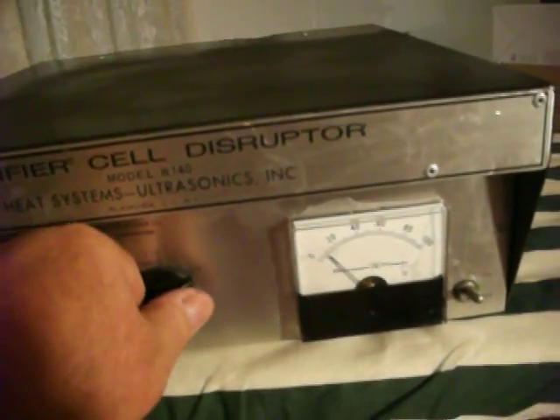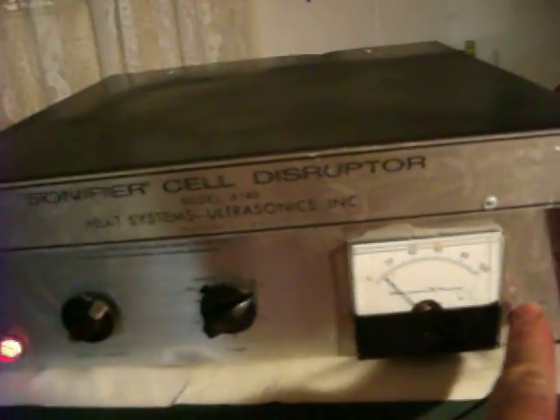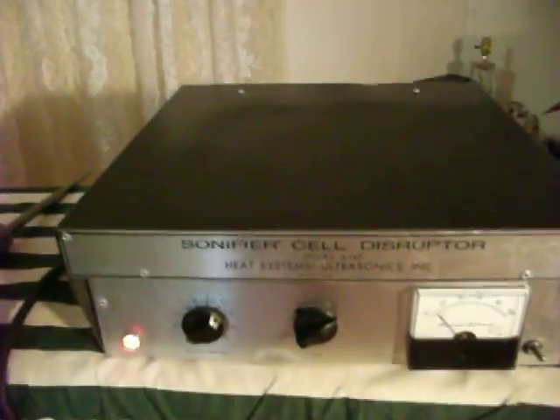Okay, that'll go off on its own. And that's it. Thank you very much for looking. No lights on, so let's turn it back on. Okay, now — okay, lights on in there.